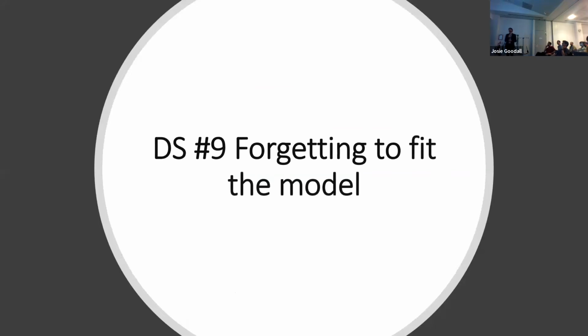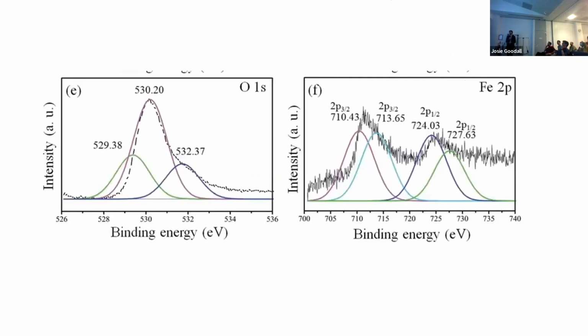Okay, number 9, forgetting to fit the model. So we don't need to say too much here. They had 3 components and exported the data straight away, using quite a nice graphing program, without pressing fit. Sad.